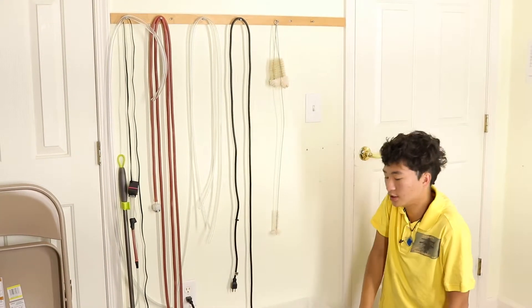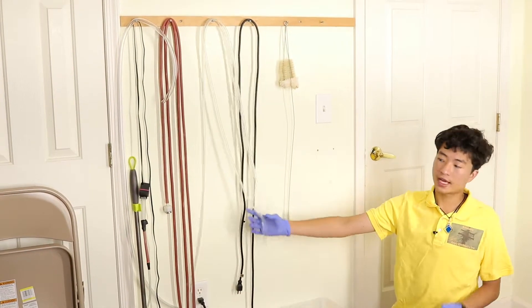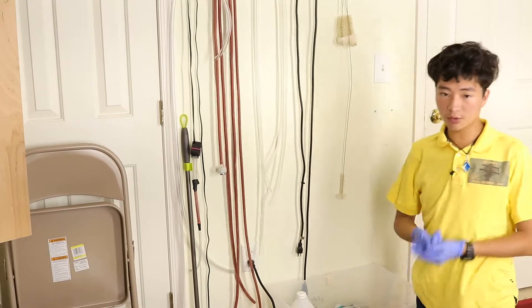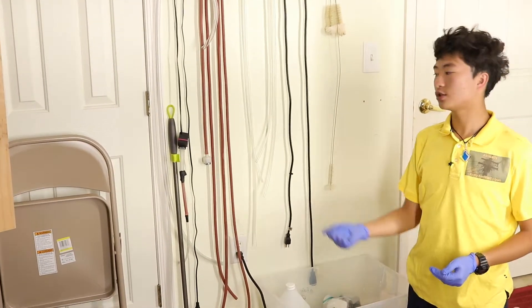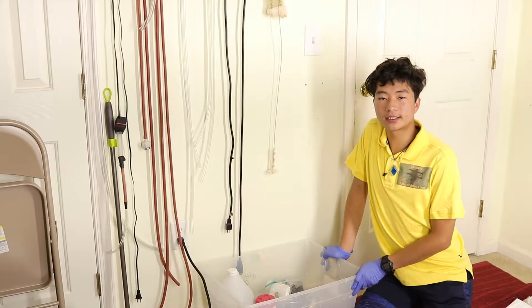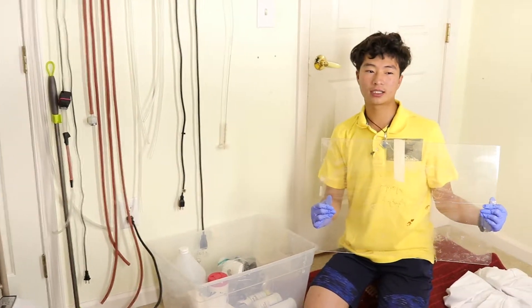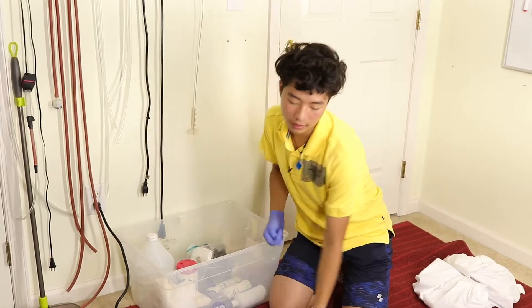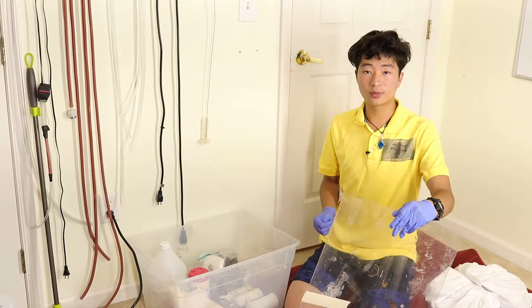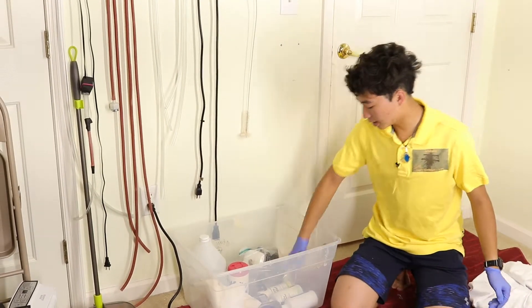In the back of the lab I store extension cords and tubing. The rubber tubes are useful for vacuum work or distillation — I connect them right to the hose. Before I started pump-based distillation I used to run the sink continuously, which was bad practice; now I use a pump. Safety is number one — here's my safety shield, which is actually the lid of my safety box. I use it when testing gas-evolving or potentially explosive compounds outdoors. It hasn't been needed yet, which is fortunate, but it would protect against debris.